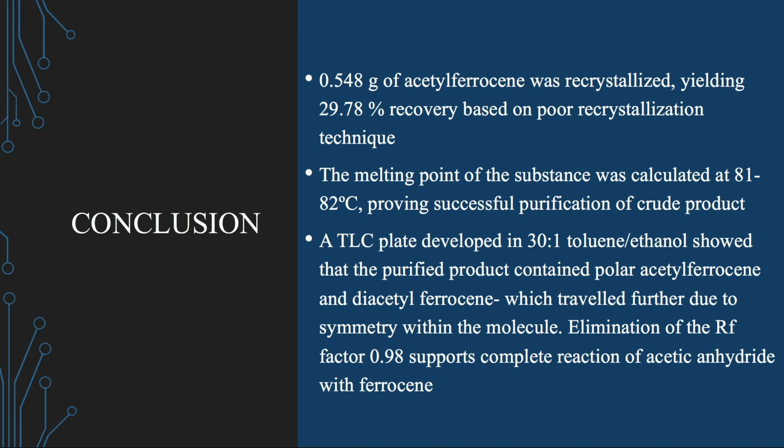The melting point of the substance was 81 to 82 degrees Celsius, which shows that the purification of the crude product was successful, and the TLC plate showed retention factors of several molecules, and showed that the purified product contained polar acetylferrocene and diacetylferrocene, and the diacetylferrocene traveled further because of the symmetry within the molecule, and the elimination of the factor 0.98 supports complete reaction of acetic anhydride with the original ferrocene sample.